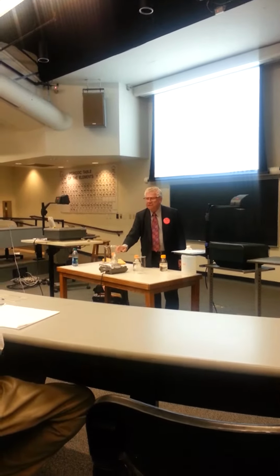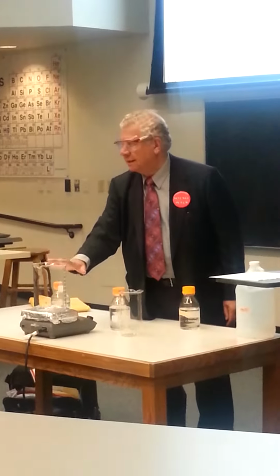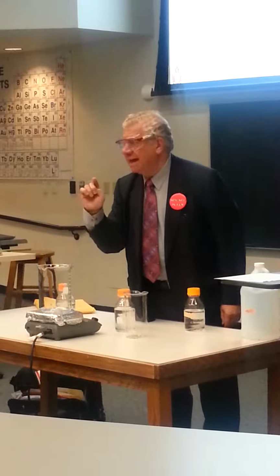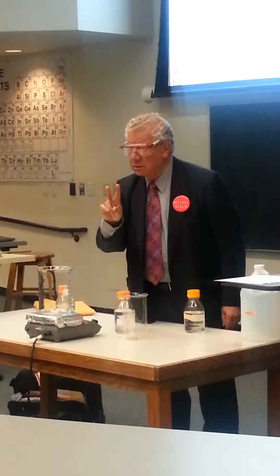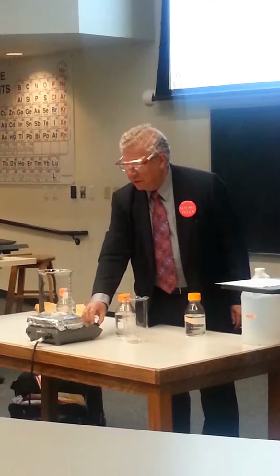This beaker has a volume of 2 liters. I ask you to look at this beaker right now, because if you look at it right now, you just learned how big 2 liters is, and you cannot unlearn it. You may forget it. Those are 2 different things. Okay? And you can see that there's a bar spinning in there.